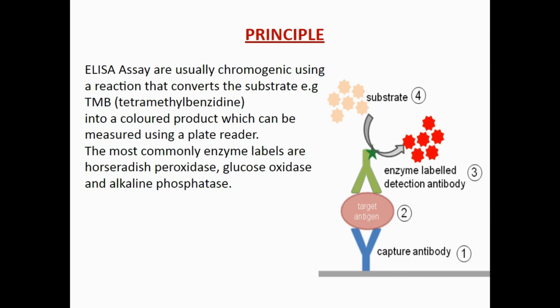Antibodies, also known as immunoglobulins, are found in blood and are produced in response to antigens. So this is quite simple. Antigens and antibodies both make complexes, and we detect these complexes separately while doing ELISA and other different techniques for the diagnosis of multiple diseases.